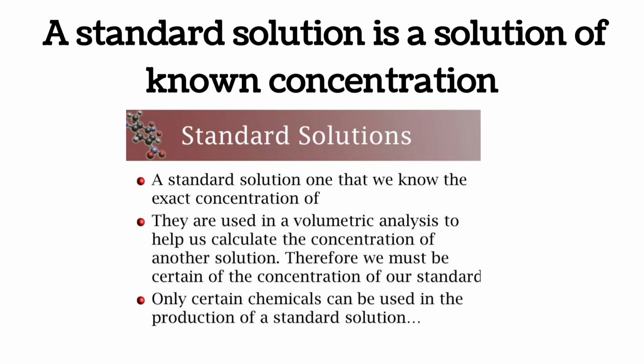Now that we know the definition of a standard solution, what are the uses of standard solutions? Standard solutions are used to determine the concentrations of other solutions, using the concentration of what we know to identify the concentration of what we do not know.